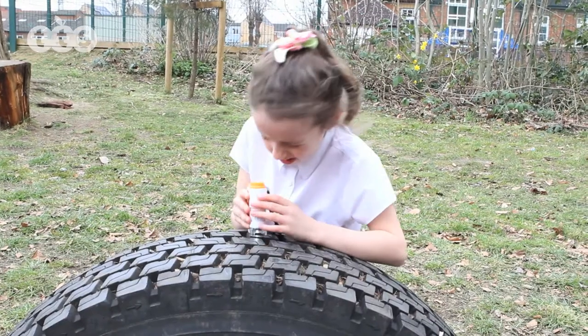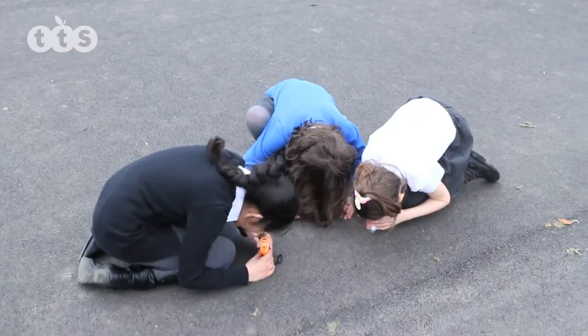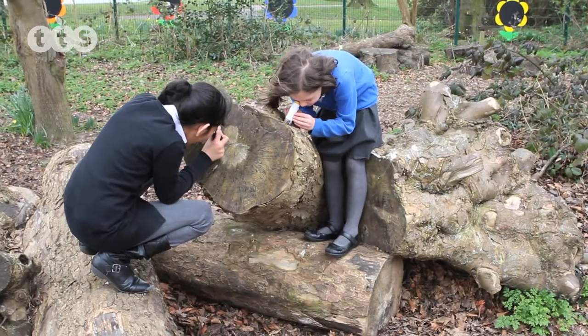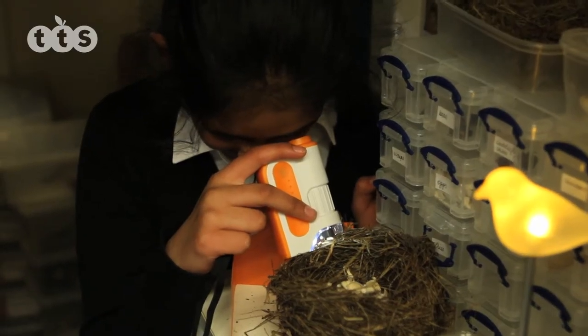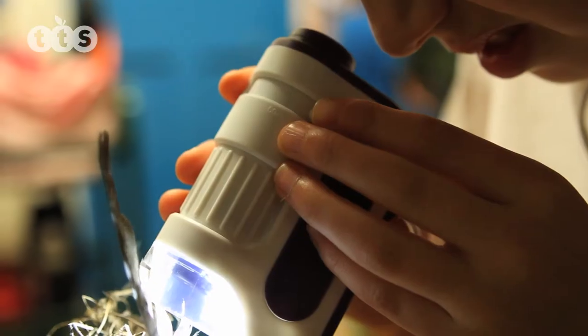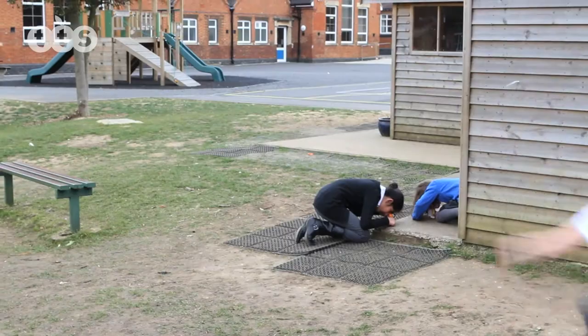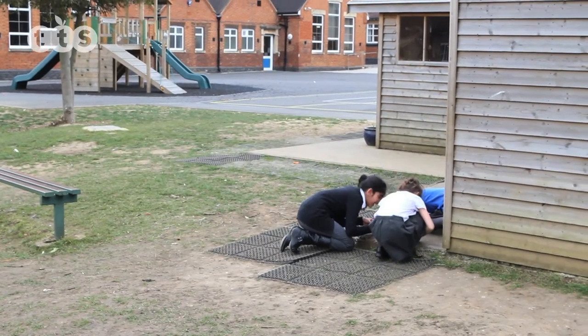Unlike conventional microscopes, where specimens have to be flat and transparent, the image seen by these is the surface of the object being viewed, so literally anything can be studied, even living specimens. Once the image has been focused upon, there is a zoom lever to give greater magnification. A wonderful open-ended general science observation tool.